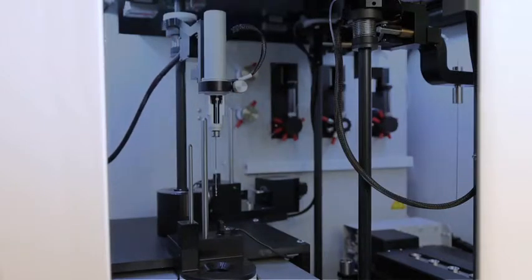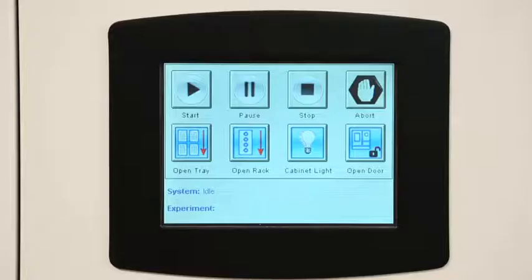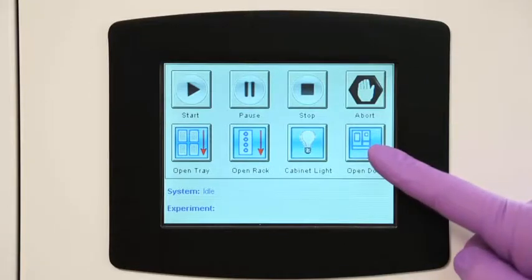After the pipette motion is complete, the user would click the Open Door button on the instrument's front panel.